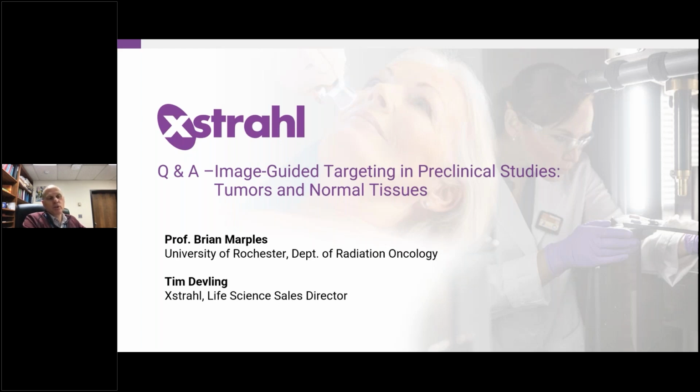So probably the fiducial marker is the way to go, but that's not appropriate if we're doing normal tissue and we're looking at inflammation and we don't want a surgical response to inflammation. So contrast will be a better option. So it's horses for courses. You take your choice, the fiducial marker or contrast, depending on what you're investigating. Tumor work, maybe fiducial markers because you're doing more treatments. Normal tissue, maybe contrast because we don't want that inflammation.